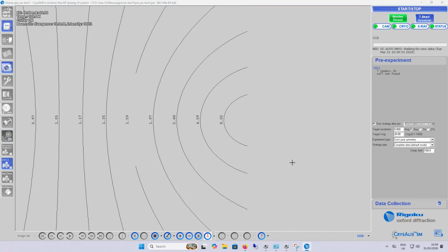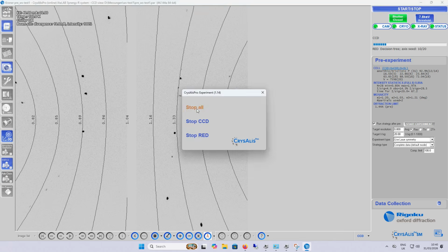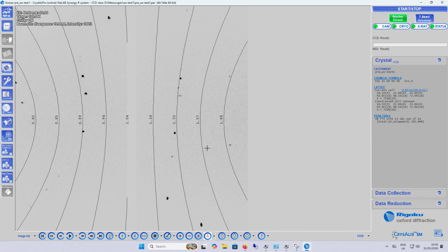Normally fluorescence is seen more in the higher angle, and that's the high angle detector position. You can see that here we don't have that problem anymore, right? We were able to remove this fluorescence signal of iron by using energy discrimination option on our detector. I will stop it, we don't need it right now. Okay, again, with our very small exposure times, we don't really see much of that, but we could also measure it like this. Why not?